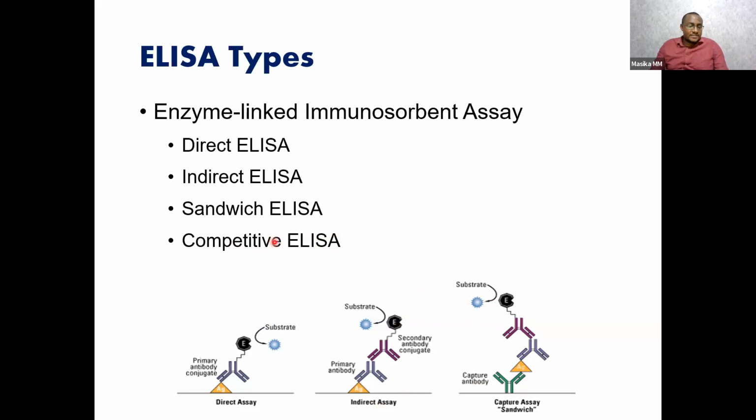So we won't discuss competitive ELISAs much. I can encourage you to check that. I want to focus on especially indirect so that we can learn how the ELISA works. If we try to teach you everything, we might get mixed up.